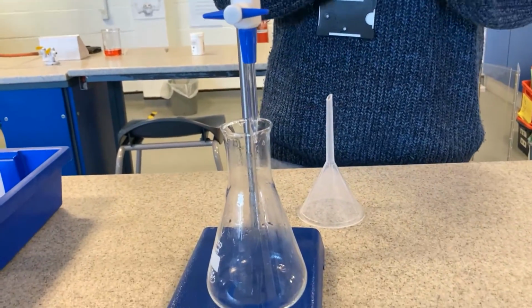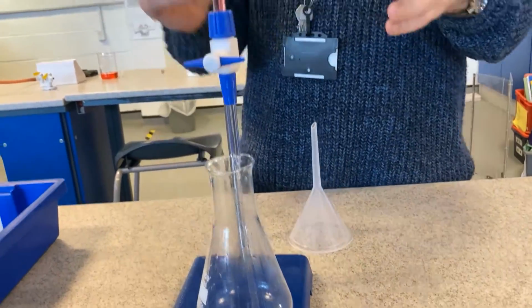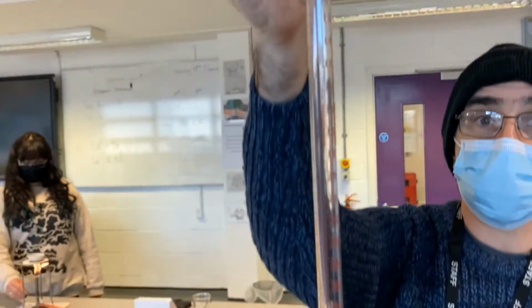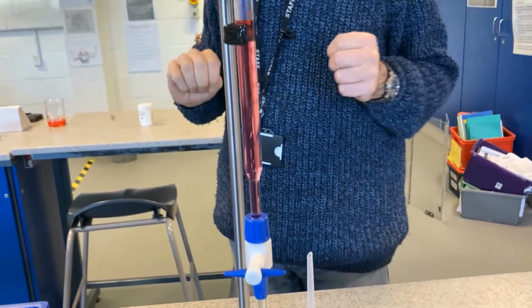Right, boys, I would like to show you another way of looking at neutralisation, and it's really good because you can actually see the whole pH scale. So I've got this thing here, which is called a burette, and the burette is a very long piece of measuring equipment. It's very, very accurate, but we're not going to use it for that. We're just going to use it for mixing together, really.